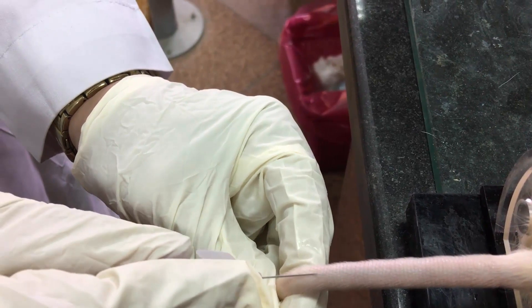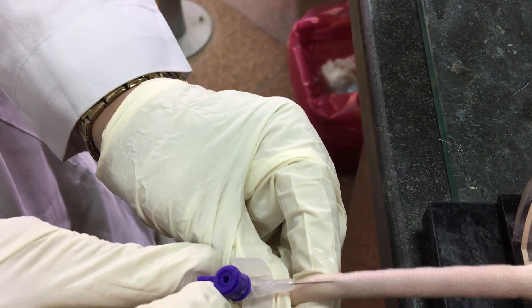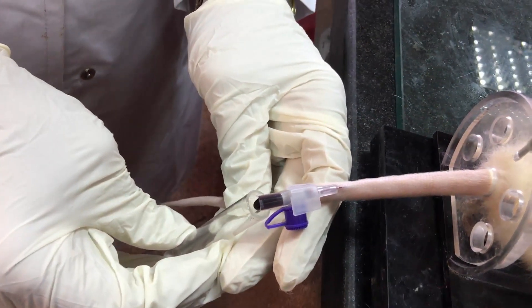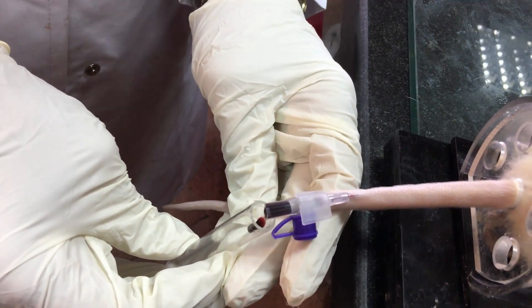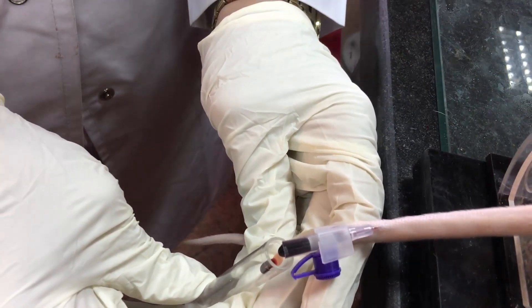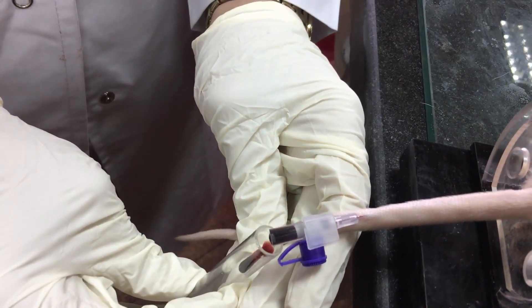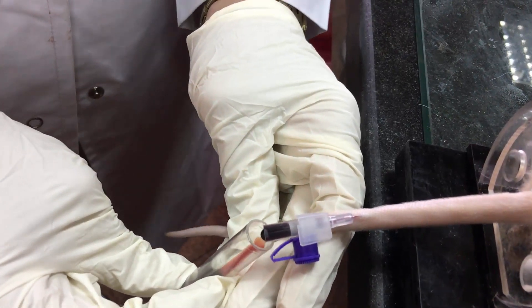If you want to repeat or take multiple blood samples, collect blood from the distal end first and then move upward. Taking the first sample from the proximal end can cause vascular clotting and inflammation, which will reduce blood flow in the area distal to the sampling point.